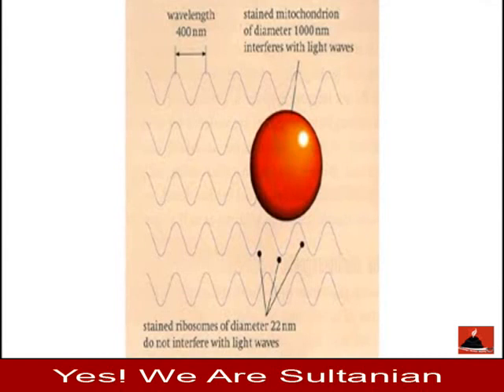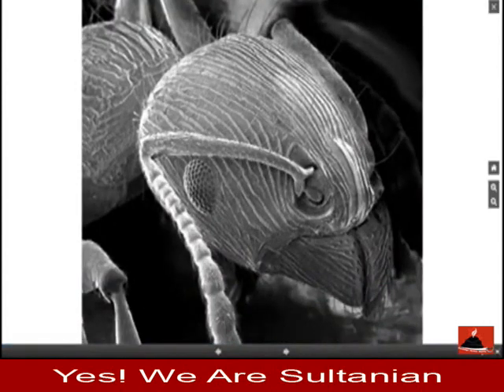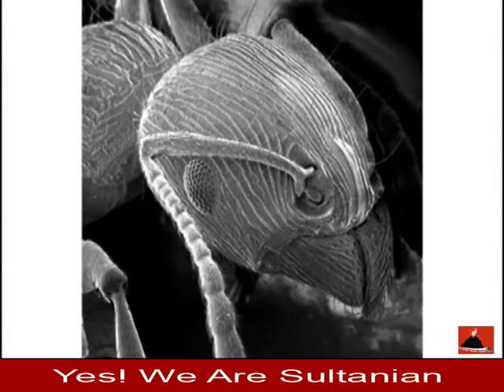So that's how an electron microscope can produce images with a much greater resolution, or resolve, which means to be able to see as distinct. It can resolve structures that are so much smaller. There are actually two types of electron microscopes. The first is a scanning electron microscope, and what you see here is a scanning electron micrograph. That's something a student asked me about the other day.